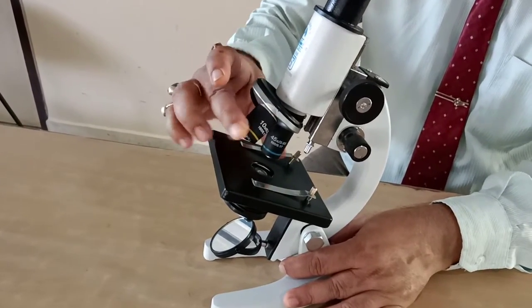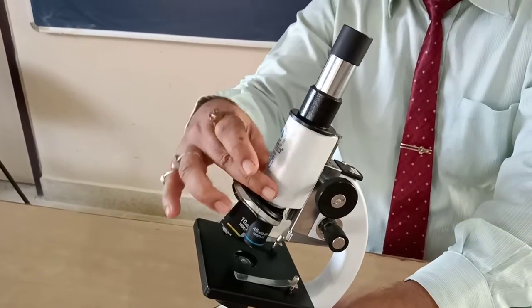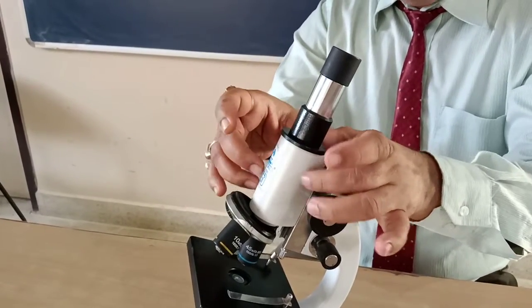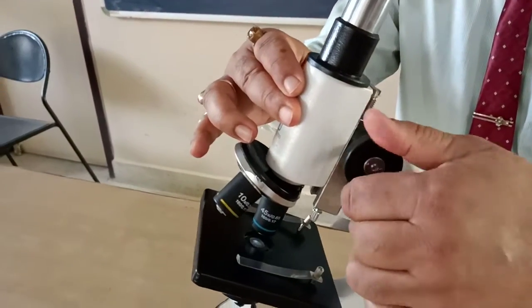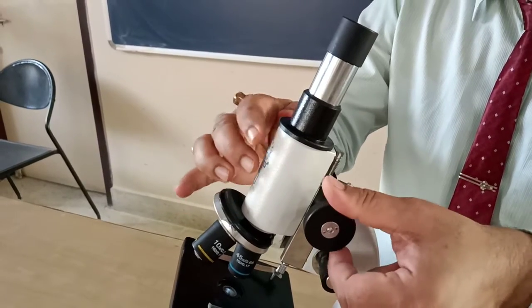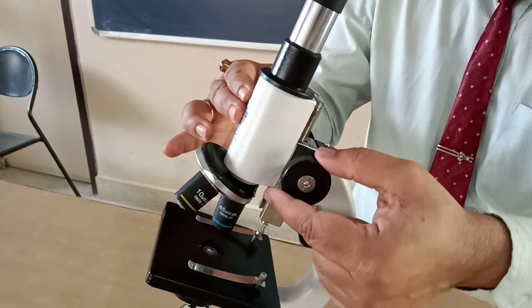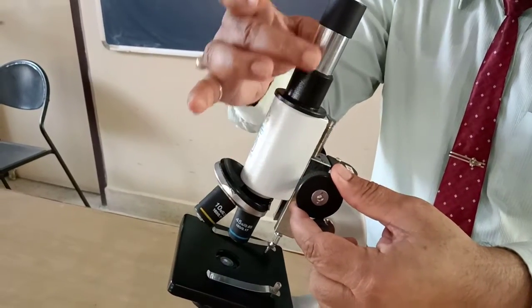Okay, and this is the body. Now the body has a tube. This is the tube in the body, fitted in the body. The body is cylindrical and the body has a tube. This tube is also movable with the help of this screw. Okay, so there are two types of screw: the broad adjustment screw, or coarse screw, and this is the fine screw. There are two types of screw to adjust the body tube.